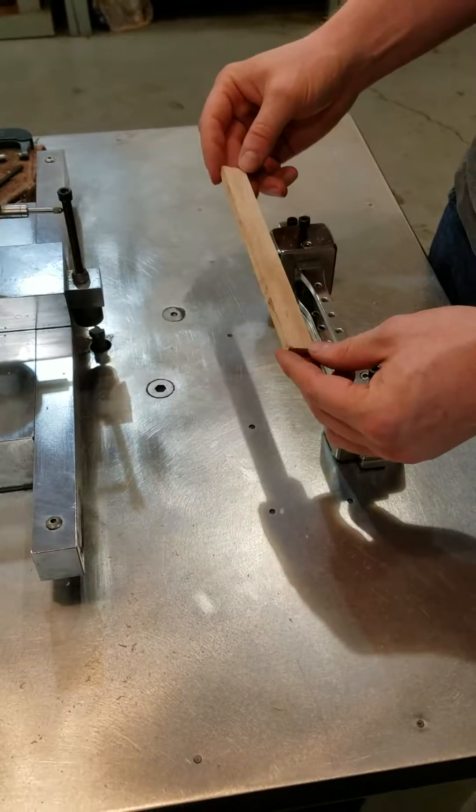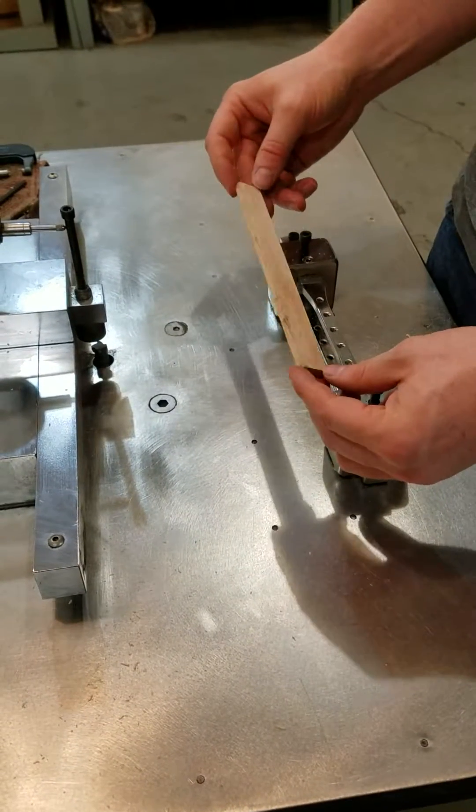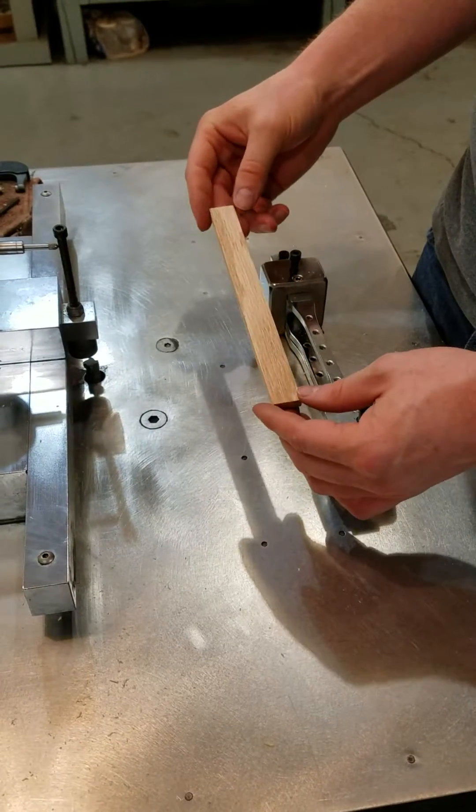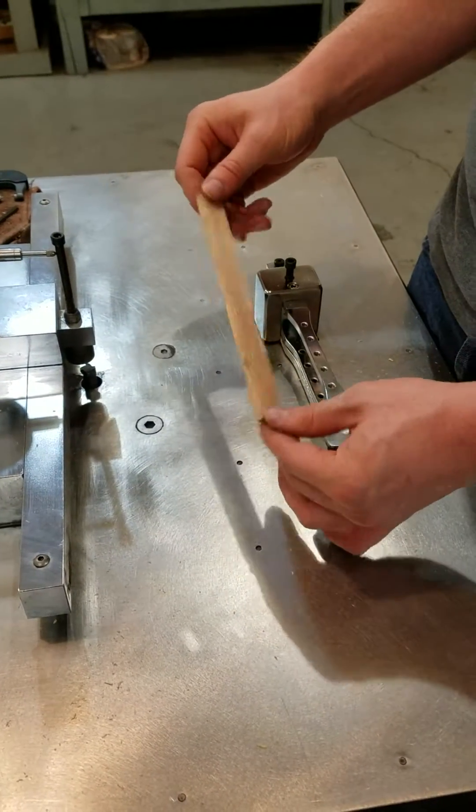Today we're going to use our shop TK2 and we're going to make a Type 1 sample out of wood. In this particular video, we're doing oak.